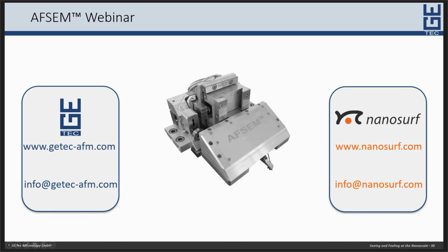Okay, and another question that popped up: is it possible to analyze non-conductive samples such as polymers in order to obtain correlative SEM and AFM images of these polymers? The first thing that you have to keep in mind, if you have a non-conductive sample in your SEM, you might charge the sample up, which might be difficult for you to measure in the SEM, but of course, yes, you can.